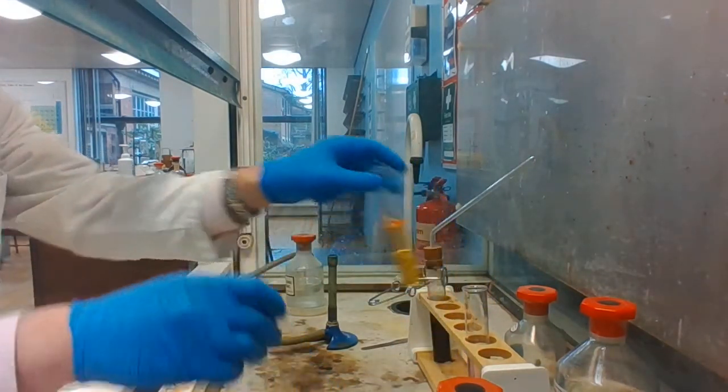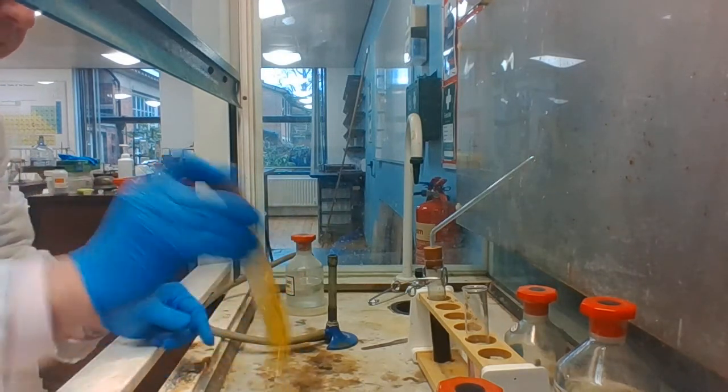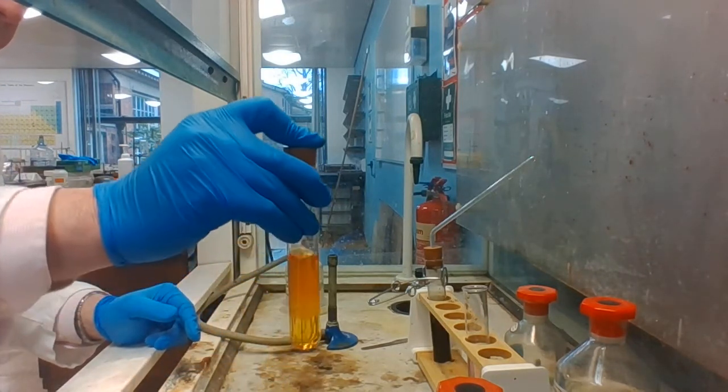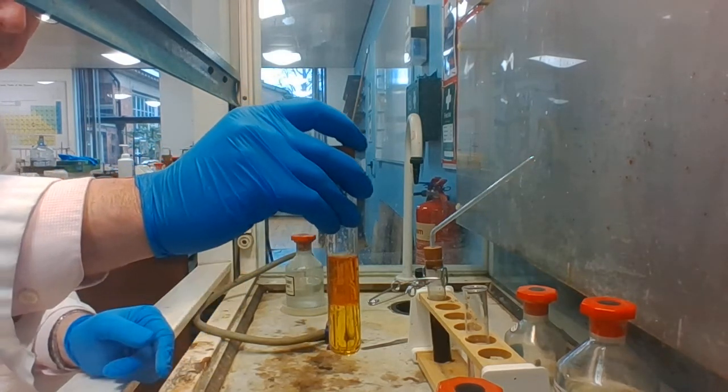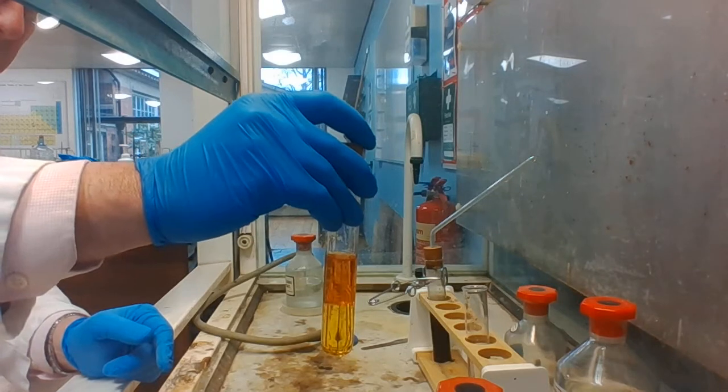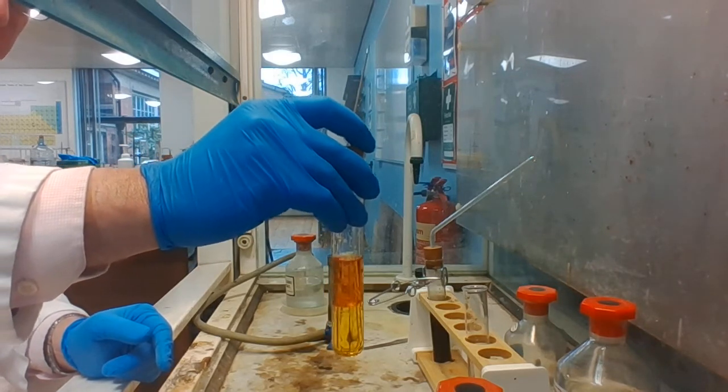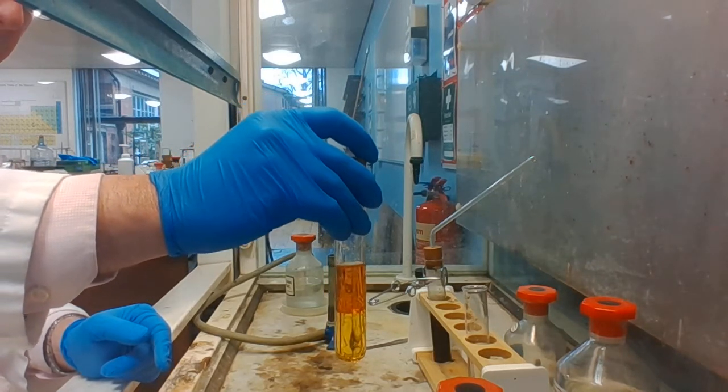And if I now shake them and we look at the color of the cyclohexane layer there on top—cyclohexane is less dense—you can see it's an orange color, and that indicates that bromine has been produced.